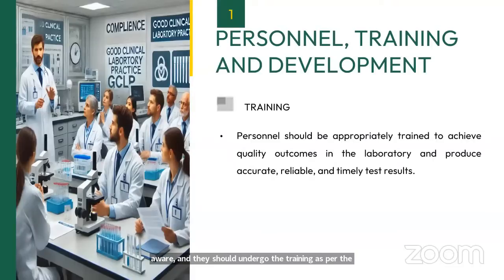Now, what are the additional trainings you have to provide to your staff? Personnel should be appropriately trained to achieve quality outcomes in the laboratory and produce accurate, reliable, and timely test results.